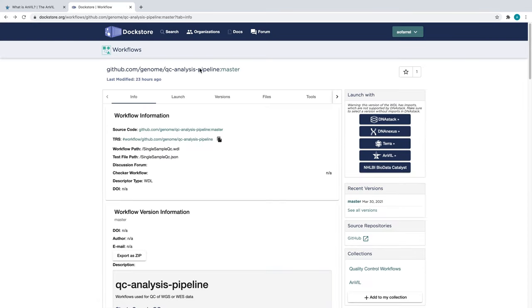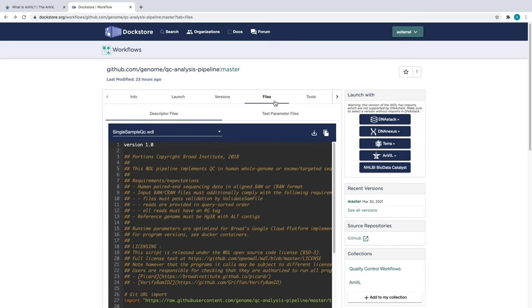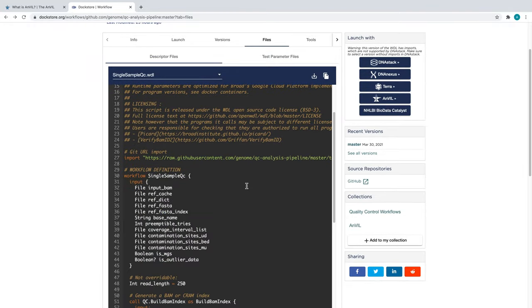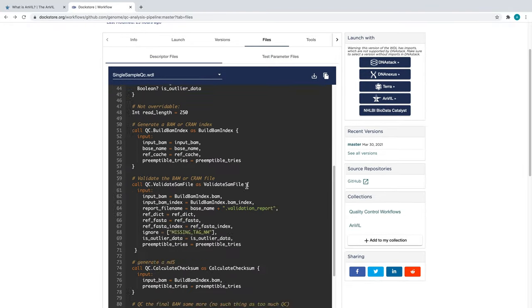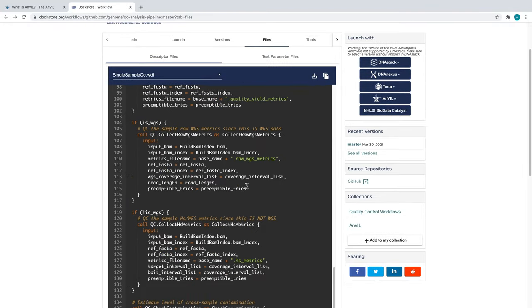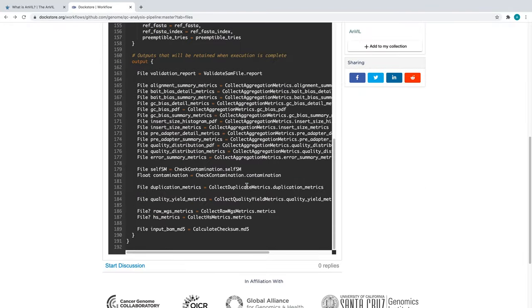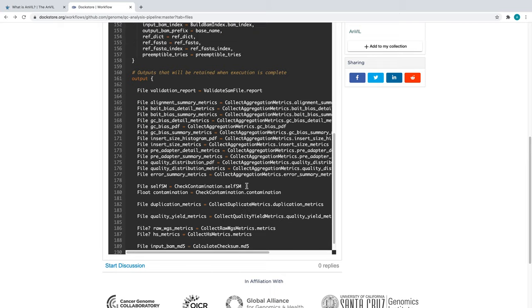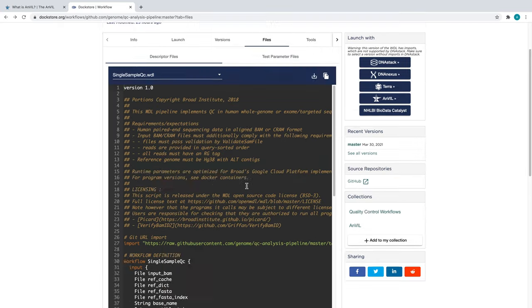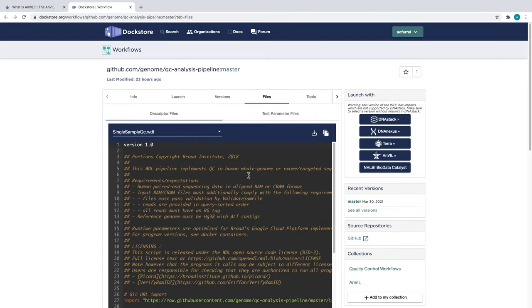If we want a preview of the WDL prior to importing it, we can click on the Files tab. Here, you can see how this workflow describes inputs and outputs of individual workflow tasks and the order in which these tasks are executed. If you would like to know more about how WDLs are constructed, we have plenty of documentation on this topic.